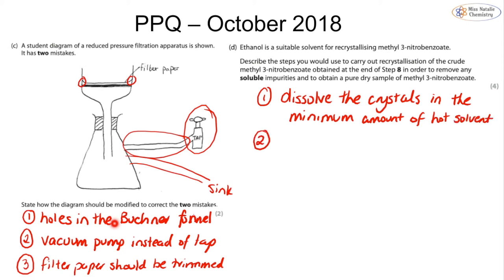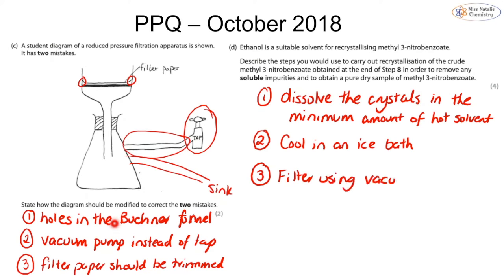The second part is then to cool in an ice bath. We then filter using a vacuum filtration.